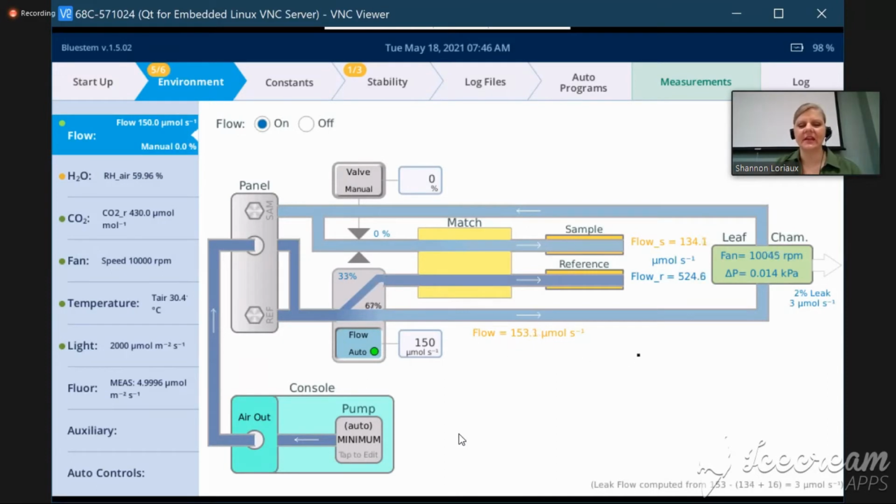And that's indicating that it's something to be concerned with, but it's not as severe as the red warning. And you'll also notice you do not have a warning in your menu bar telling you your flow sample is too low.